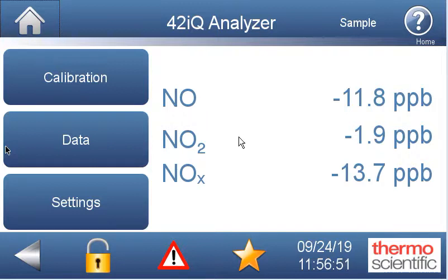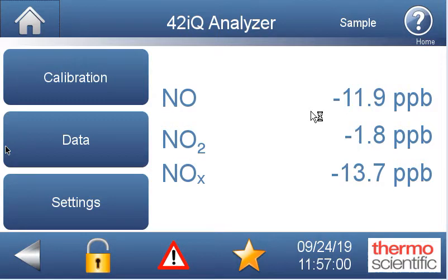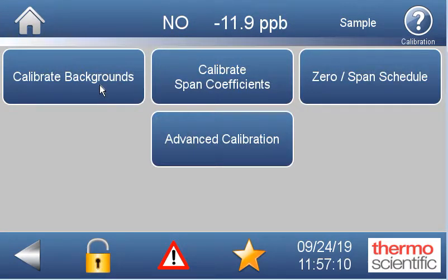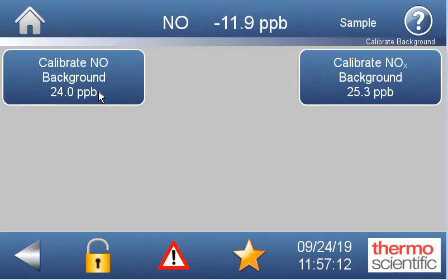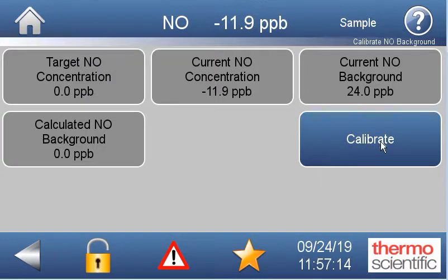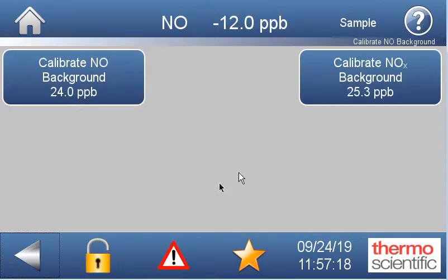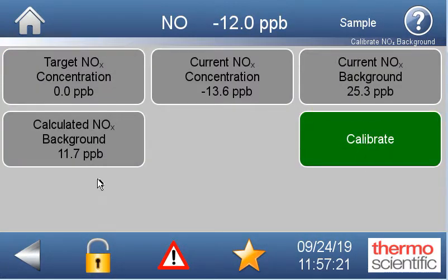You'll need a way to deliver zero air and also your span gas. Starting out assuming that you're flowing zero gas right now and your readings are stable, the first thing we'd do is come into calibration, then calibrate backgrounds, and hit calibrate — that will accept the NO calibration for the zero. We'd do the same thing for the NOx and hit calibrate. Now our backgrounds are set.